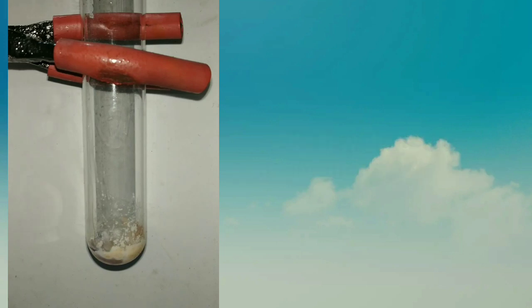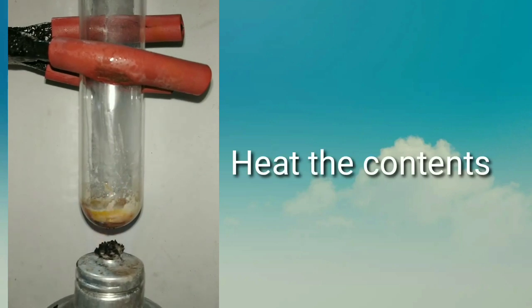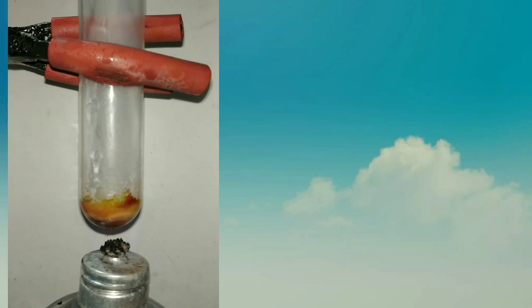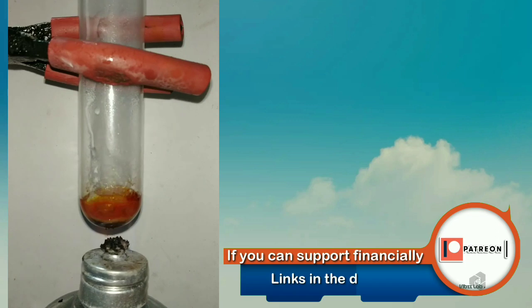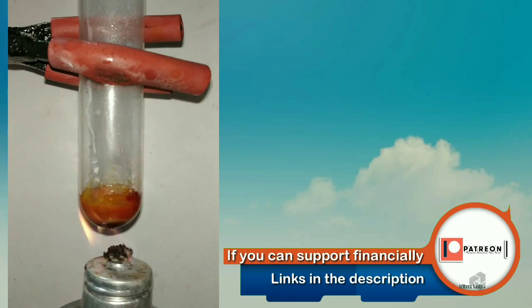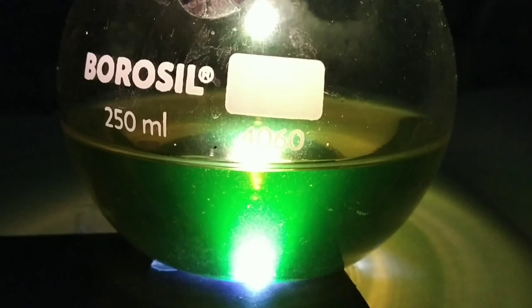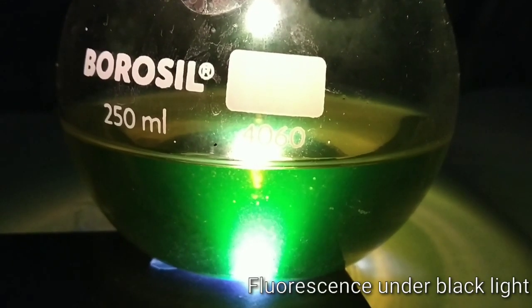And on heating phthalic anhydride with resorcinol, we get the compound fluorescein. The importance of fluorescein is the presence of the property of fluorescence in UV light. On passing the black light through the fluorescein solution, you observe the fluorescence.